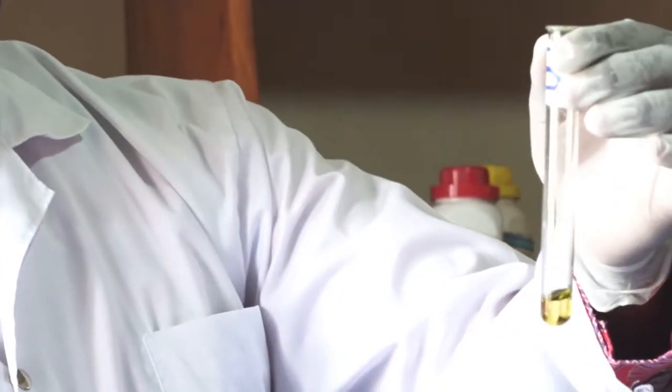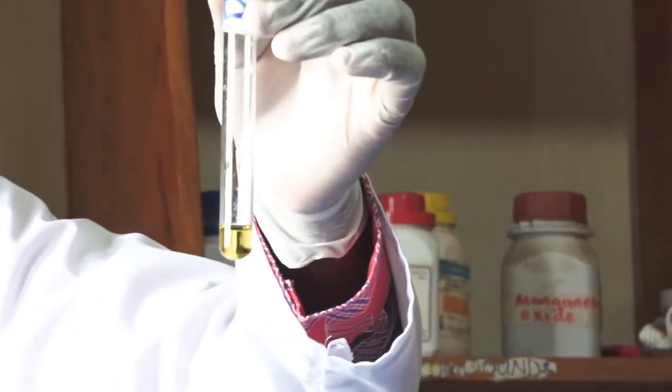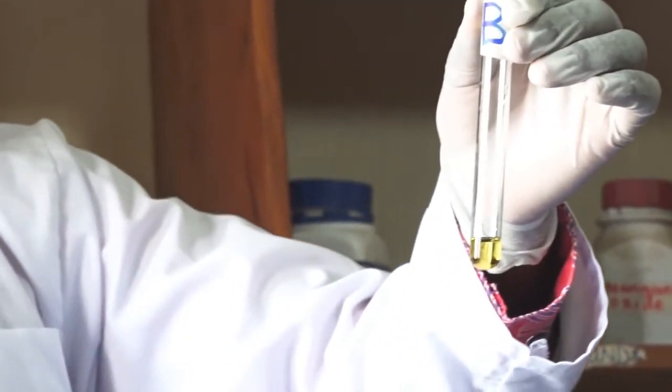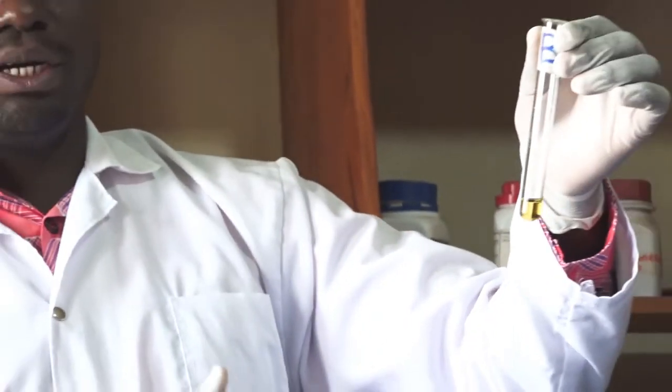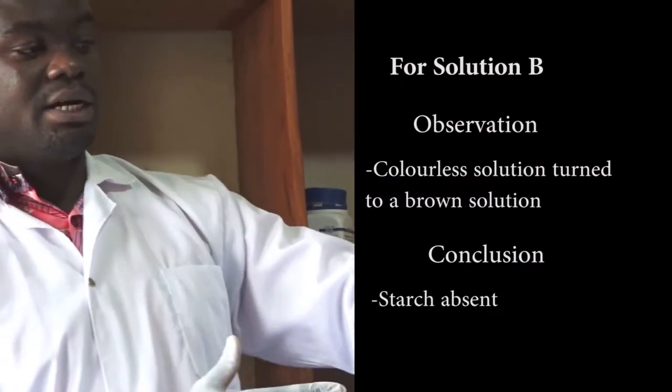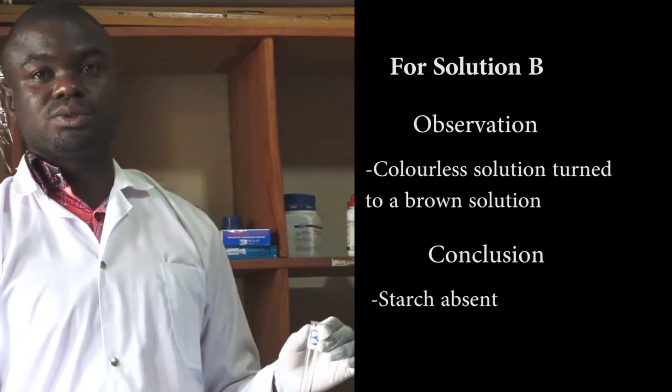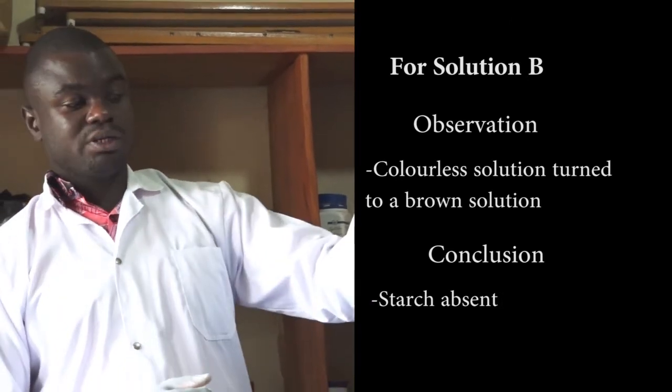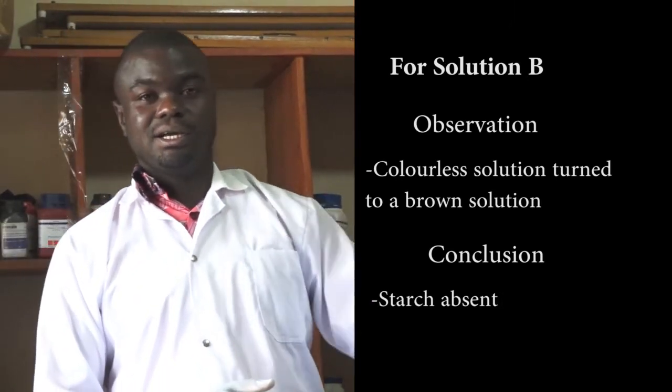There you go, our final color. And we can see that it is brown. So in our observation here we can see that the colorless solution turned into a brown solution. And the conclusion here is starch absent.